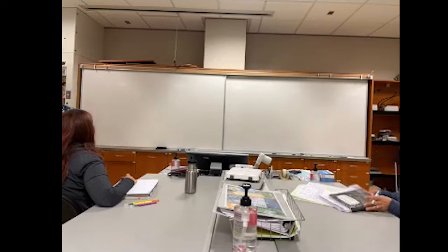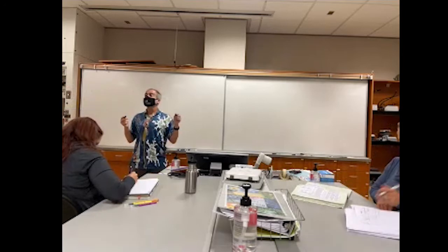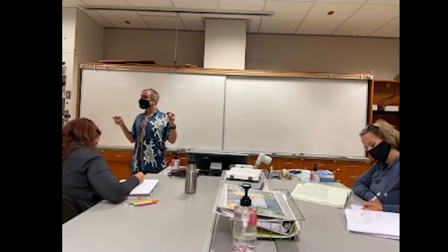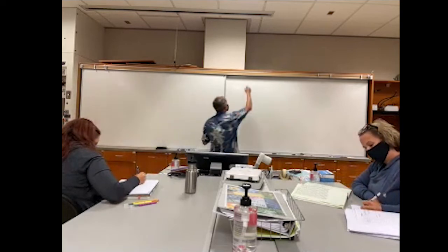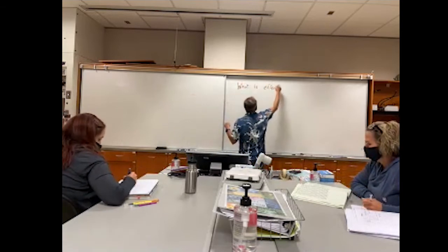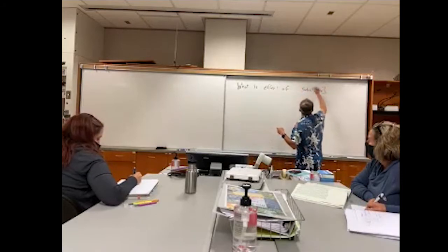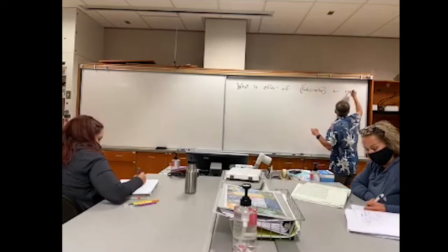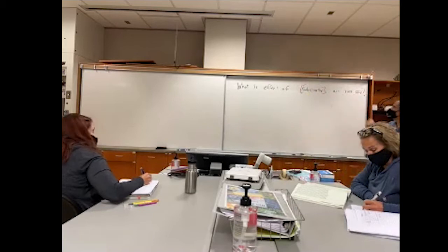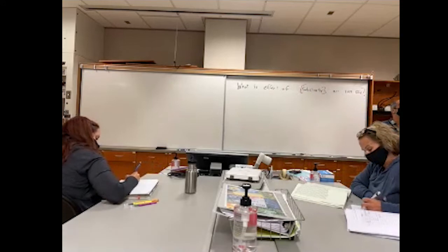What is the objective of our lab today, this enzyme lab? What is the relationship of substrate concentration? Yeah, that's exactly it. Let's say, what is the effect of substrate concentration on reaction rate? Or you could say, how is reaction rate affected by substrate concentration, or however you want to do it.